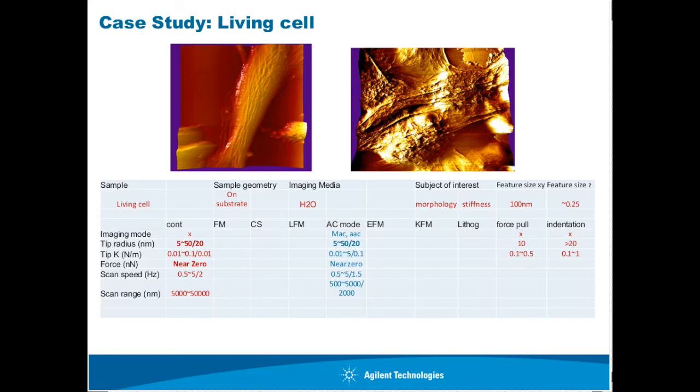I actually had one of these AFM on battery studies, and there's more work than just choosing the tips. You have to modify the electrochemical cell, the EC cell. If we are talking about regular batteries, it's easy. You just construct the electrochemical cell. When you do a lithium battery, you have to construct all these things inside a glove box, under the protection of an atmosphere with no oxygen and humidity, so you have to construct the whole electrochemical cell with your gloves on. And that's very difficult.